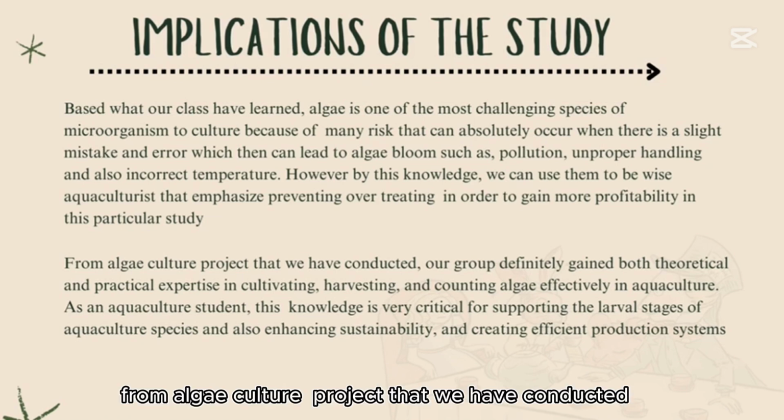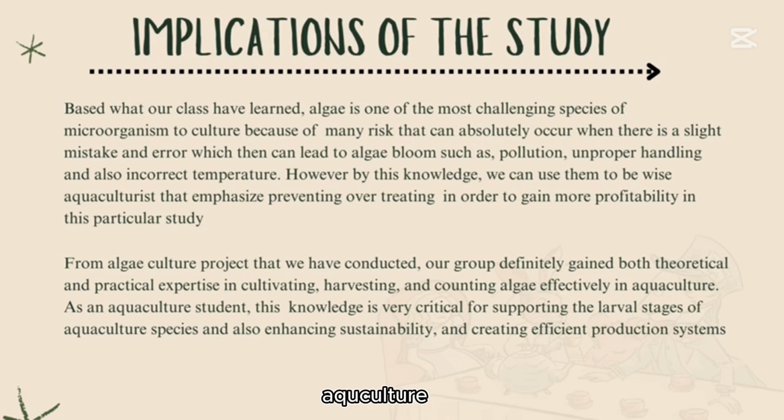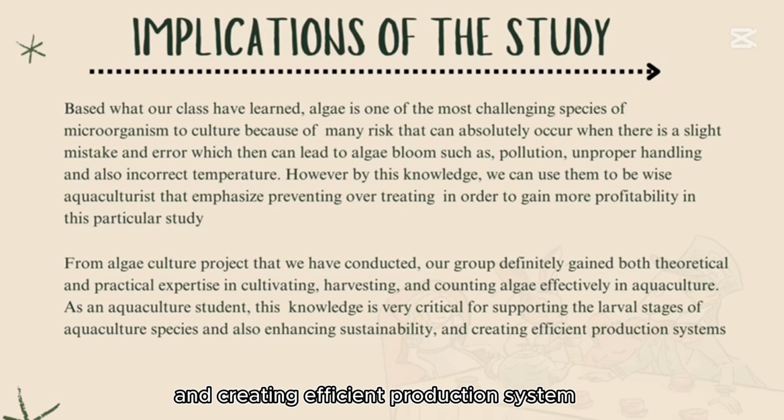From the algae culture project that we have conducted, our group definitely gained both theoretical and practical expertise in cultivating, harvesting, and counting algae effectively in aquaculture. As aquaculture students, this knowledge is very critical for supporting the larval stages of aquaculture species and also enhancing sustainability and creating efficient production systems.